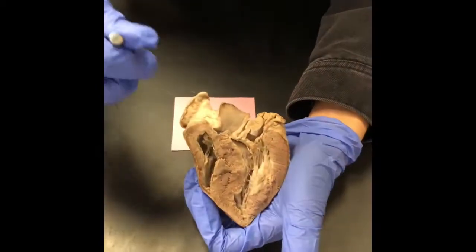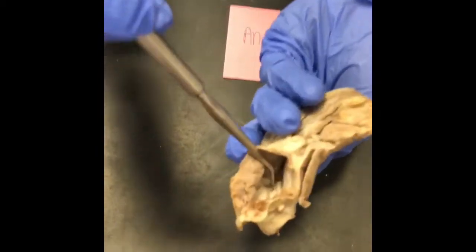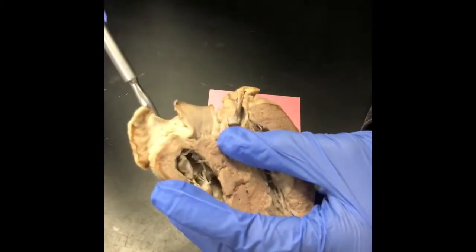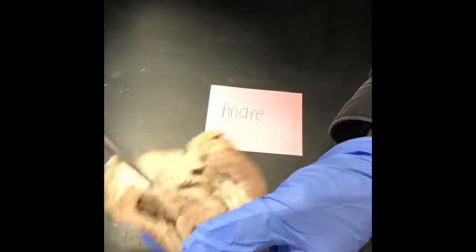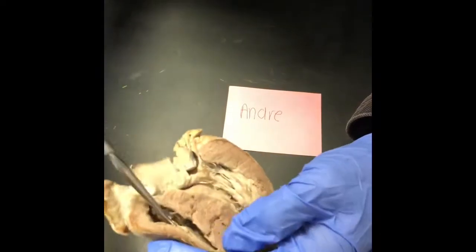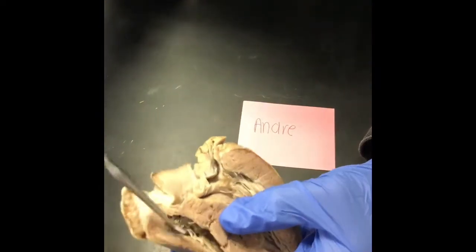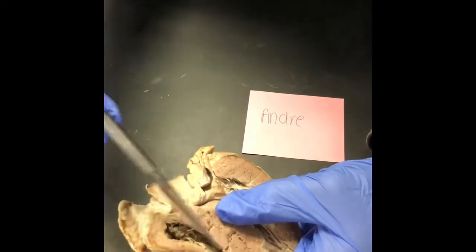So here we have the posterior view of our sheep heart, and from the superior vena cava, we could see that our heartstrings right here, which is also commonly referred to as the chordae tendineae. It can be found on both sides over here and right here. The function of the chordae tendineae is that it helps close both valves. It helps close the tricuspid valve so that it prevents backflow right back into the atrium when blood flows through the valve to the ventricle.